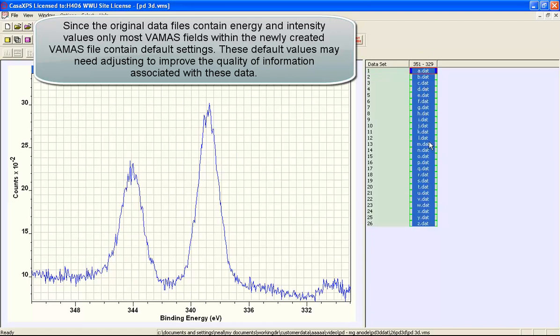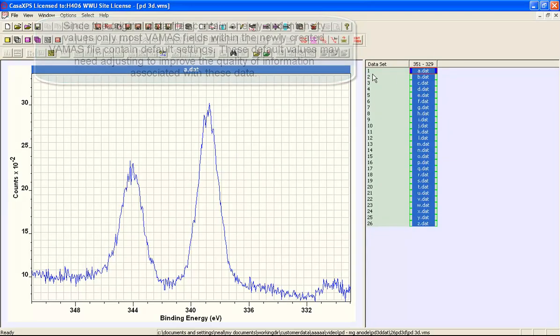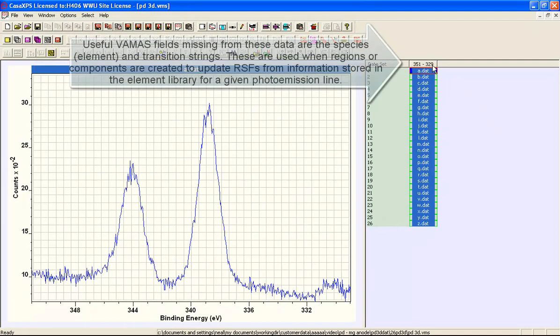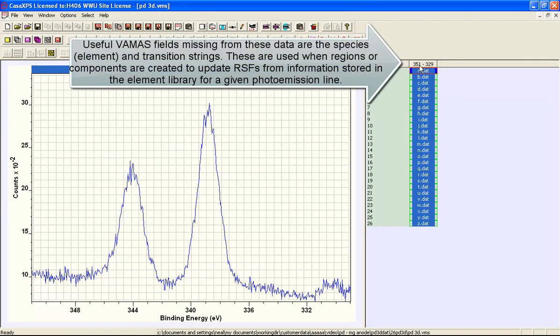Each one of these represents the files that were in the directory. It's calculated the range for the binding energy and this is the element transition because there's no information about what these data actually are.